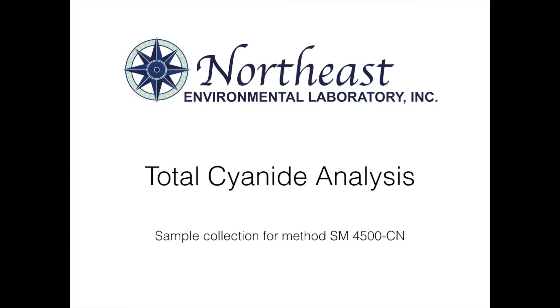In this video, we will show you how to collect samples for total cyanide analysis by standard methods 4500-CN.